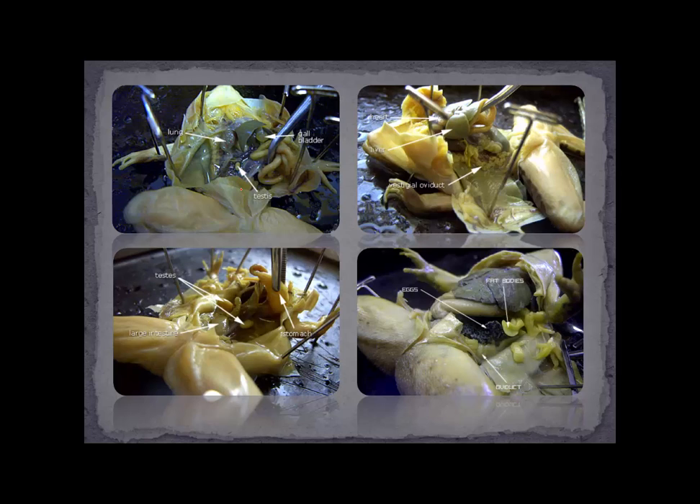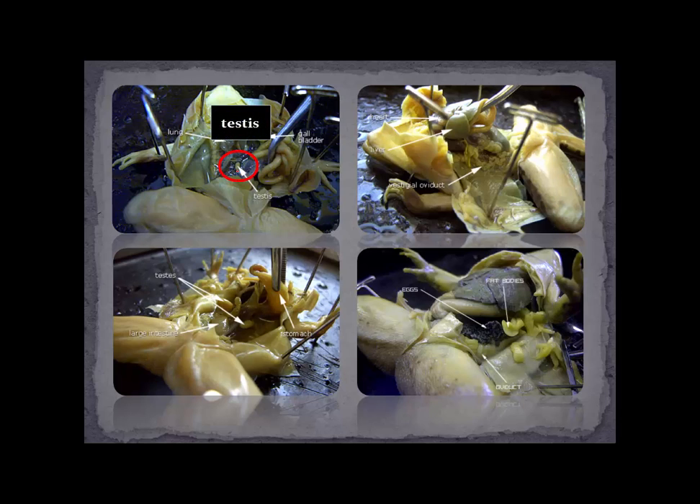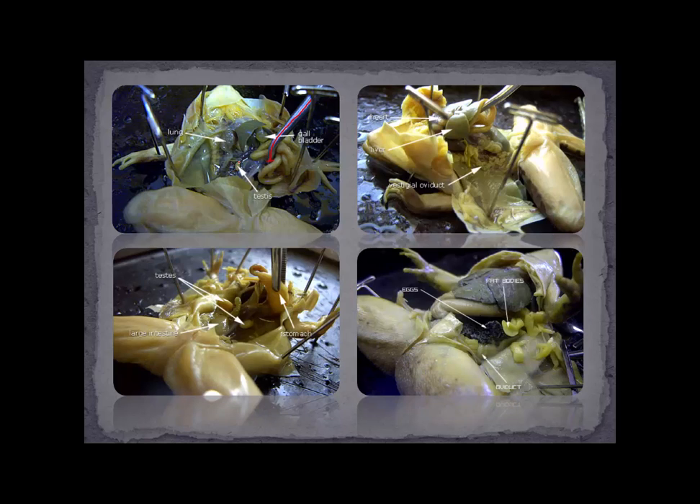Now we have our first sign of whether this is a male or female frog. If you guessed male, you'd be right. There is a testis here — a bean-shaped, yellowish organ attached to the body wall towards the back. In order to find that, this person has taken a blunt probe and pulled back the intestines so that it can be found. You want to look for a testis on one side, then push the intestines to the other side and find the other testis. Often one is higher than the other and they may be different sizes — that's how you tell whether you've got a male or female.